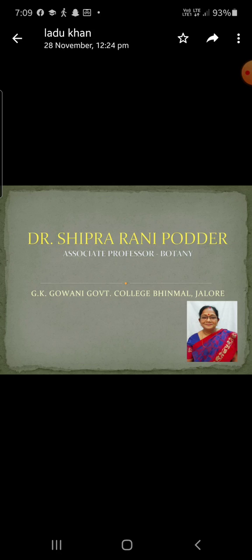There are several vascular bundles in the ground tissue and they are arranged in a typical inverted omega-like arc. The vascular bundles are conjoint, collateral and open, and each is surrounded by a single layer bundle sheath composed of thick wall cells. They are diploxylic, that is, they have both the centrifugal and centripetal xylem.